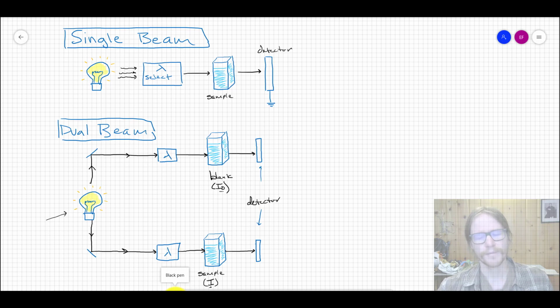It doesn't really matter because if this thing is at a cooler temperature and it's not really heated up, you're still measuring these two things simultaneously. So when you want to compute the transmittance as the intensity over the full intensity with the blank, it doesn't matter. These two things are measured simultaneously in time, so that instrument drift component doesn't change things.